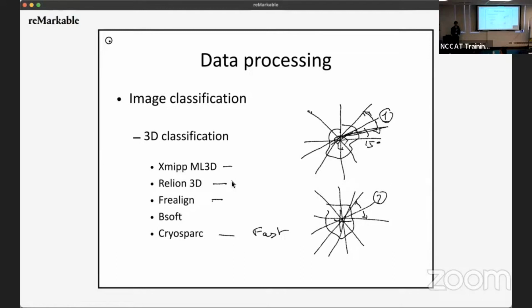And from my experience, having played with that a lot, the choice is made properly somewhere around 2 degrees. So you need to go all the way down to 1.8 degrees in Relion to make that choice, which means that you no longer look broadly at the angular sphere, you're looking at it locally within plus minus 10 degrees. And there's another problem with that, which is you might constrain your classification by that angular range.